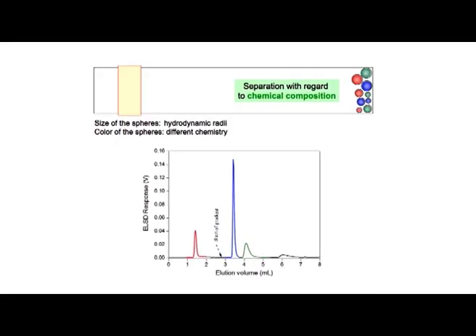As we can see here, I have given the separation of the components. The color of the ball says the different chemical nature, and the size of the ball says the molecular weight. In the case of size exclusion, we had separation not according to chemical nature, but according to the size of the sample. So the dots or balls having the same size are separated irrespective of their chemical nature. But in the case of HPLC, the separation mechanism is based on adsorption. So, here the separation occurs according to chemical nature.